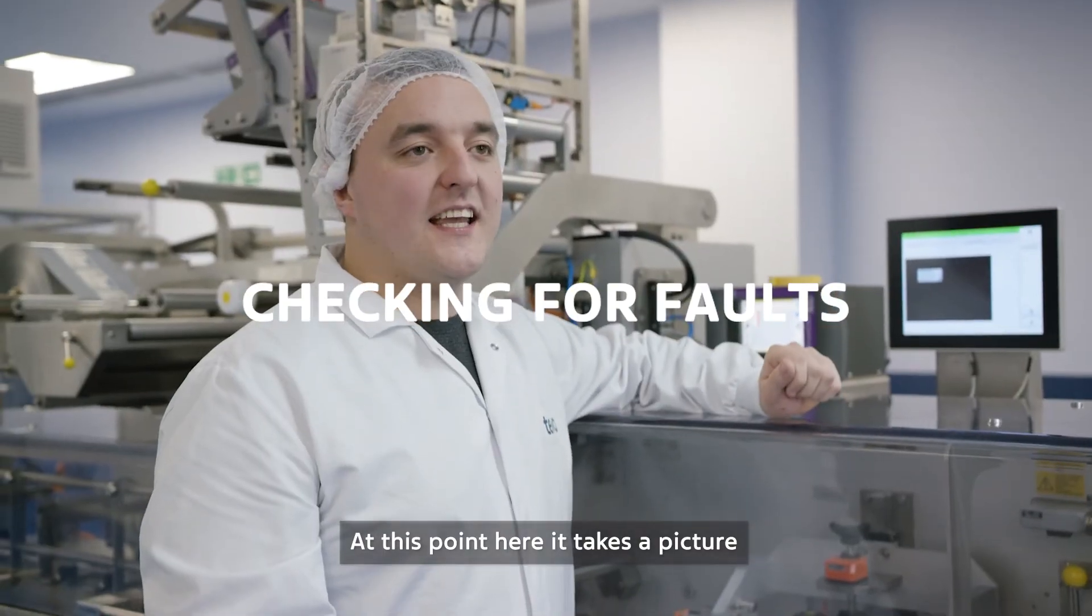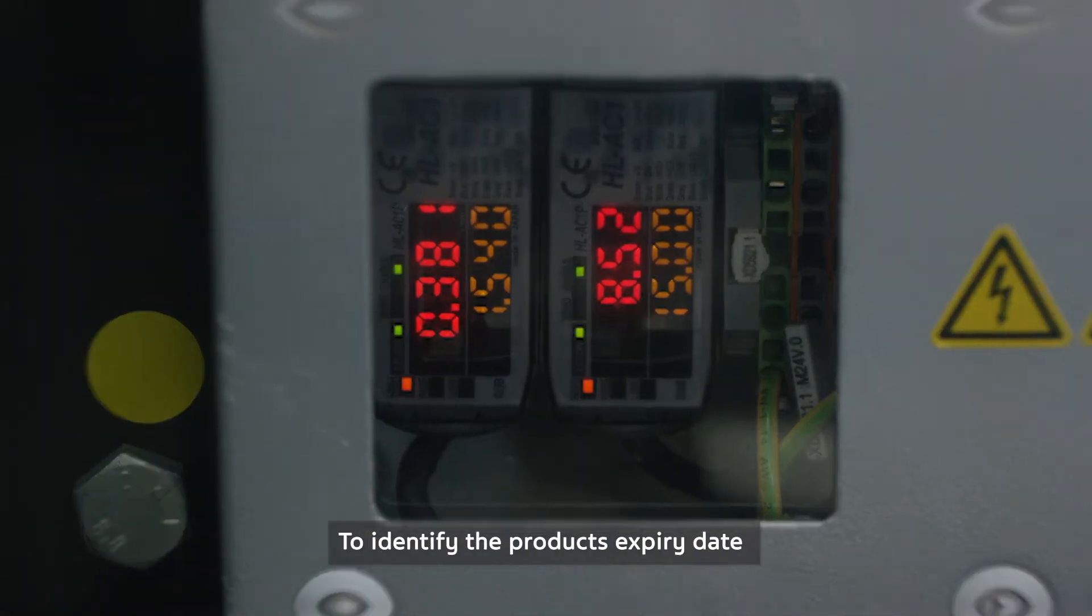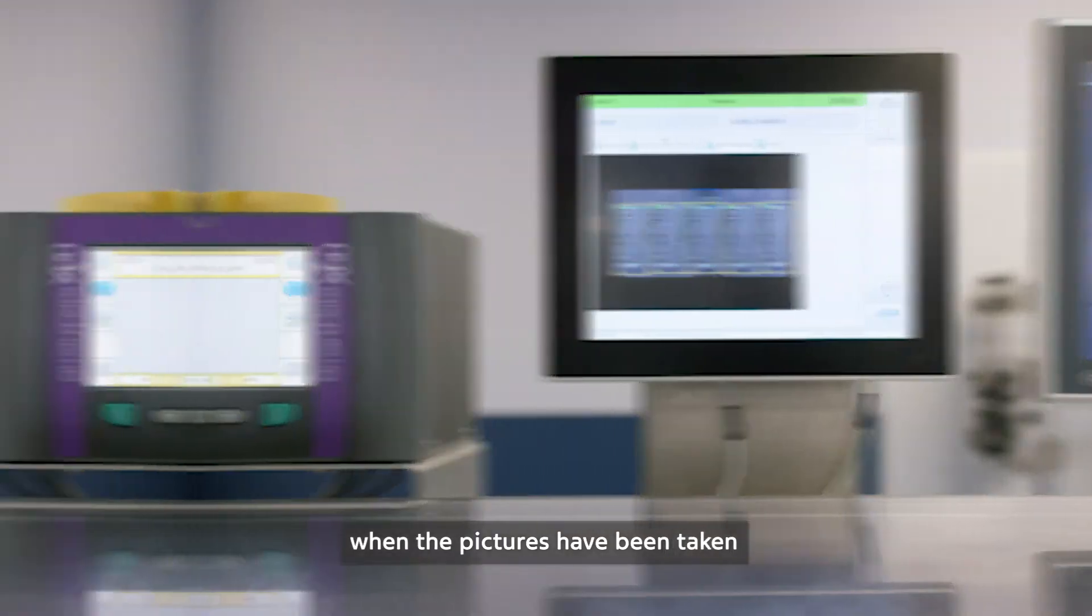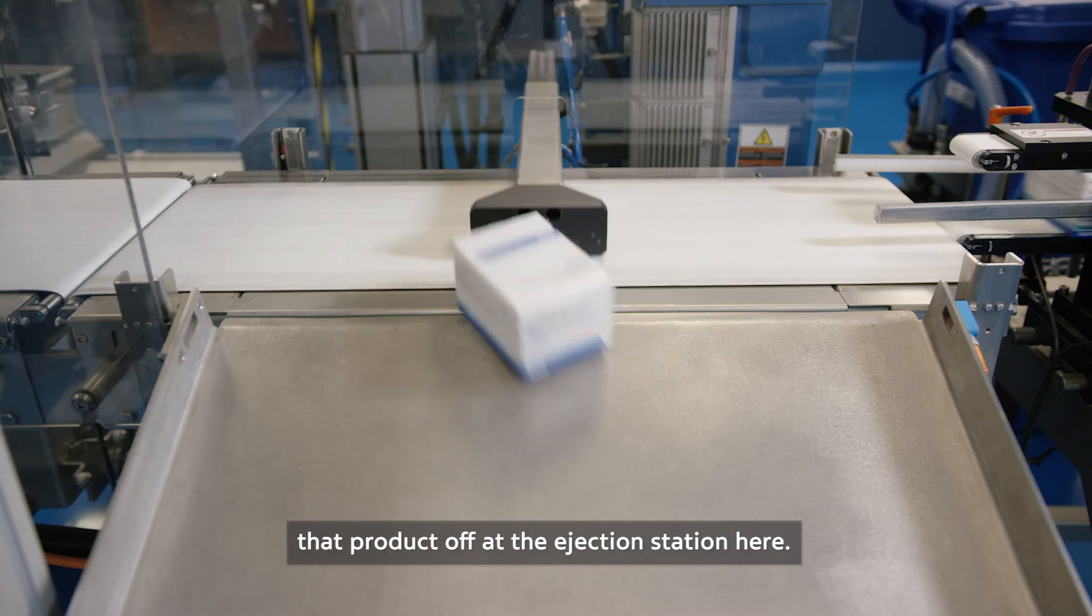At this point here, it takes a picture of the variable data that is being applied to the foil pouch to identify the product's expiry date and batch number. When the pictures have been taken, it recognizes if there's any fault with the picture and it ejects that product off at this ejection station here.